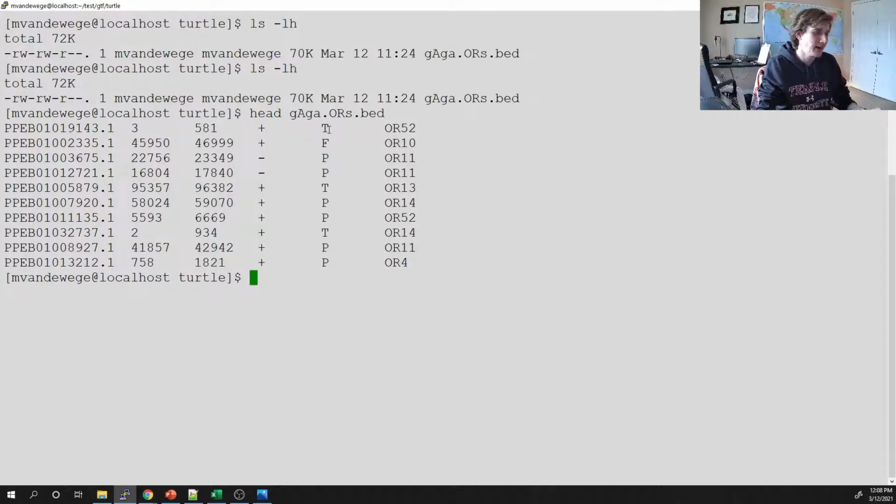So I have a few identifiers in here. This sequence starts on the third base of a contig, so it probably means I don't have the full gene. Again, a contig doesn't reflect a chromosome, and contigs kind of fragment a genome. But nonetheless, it's the best we have to work with, so we do what we can.